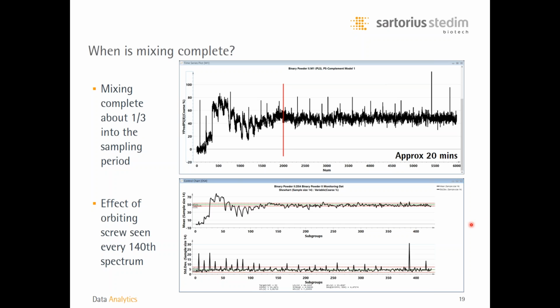The main conclusion here was that PLS and primarily OPLS was very successful, and the results of this study were really encouraging and indicated that NIR was suitable for monitoring this mixing experiment, and that OPLS modeling of the relationships between the NIR spectra and the various Y variables was a very good and fruitful approach.